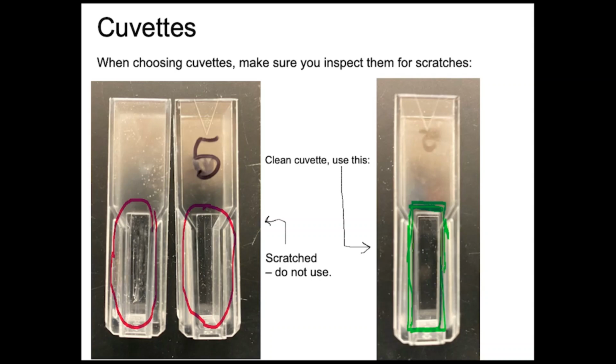These are a little bit fancier, and the optical window is minimized, but in the ones we're using in the actual experiment, those have more of an open face, and they're clear on 2 sides and then cloudy on 2 other sides, and basically you know which way to have them facing because of the triangle on the one side, and that's going to tell you which way it should be facing, and that's going to be better explained in another clip where I'm putting the cuvettes in the spectrophotometer.